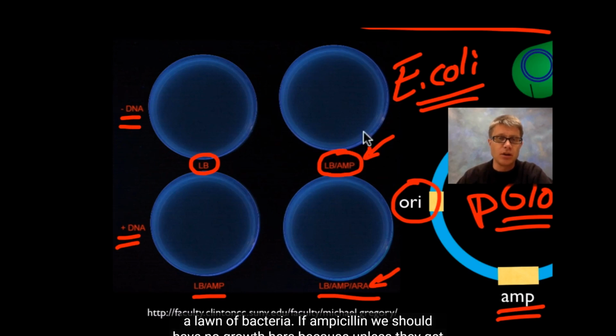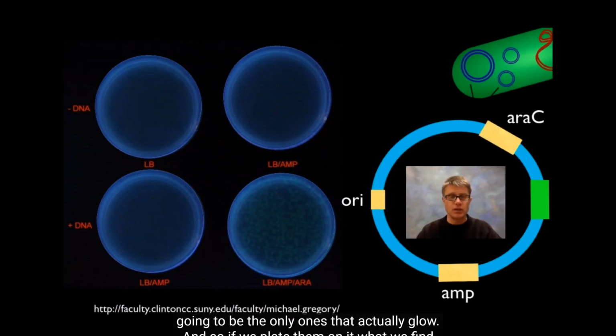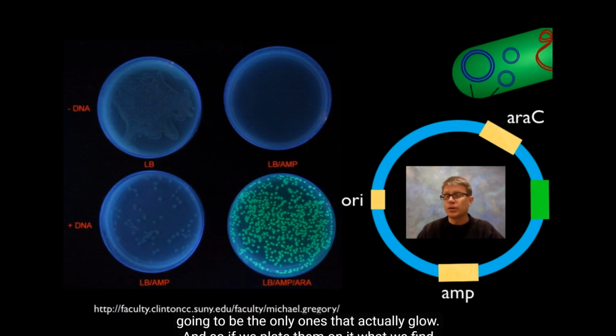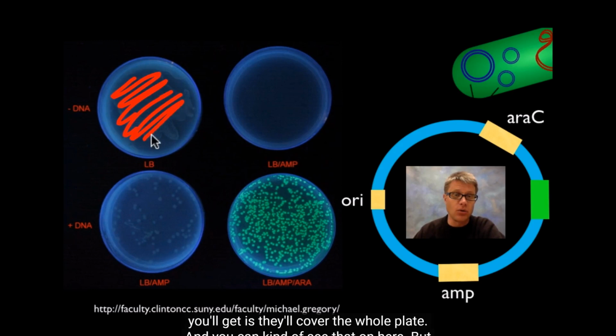With ampicillin, we should have no growth here, because unless they get that ampicillin resistance, they're not going to be able to grow. LB ampicillin, the ones who get the plasmid, should be able to grow if they're transformed, and then these are going to be the only ones that actually glow. And so if we plate them on it, what we find is that the ones that didn't get the plasmid, but they're on Luria broth, will cover the whole of the plate. You can see that on here.